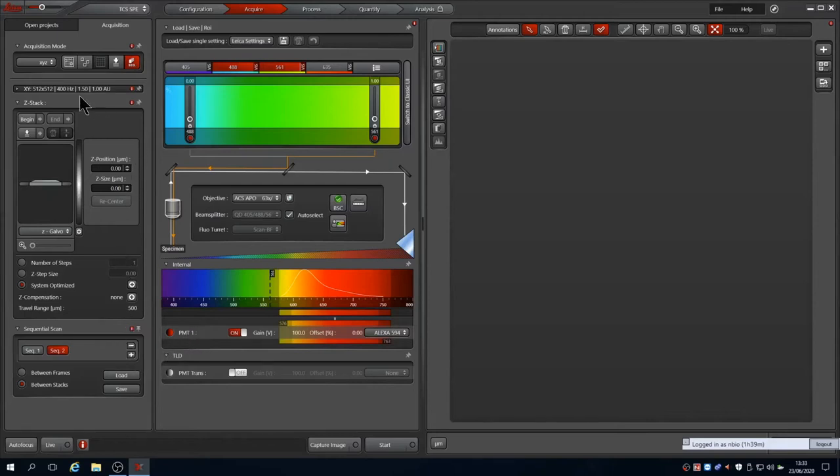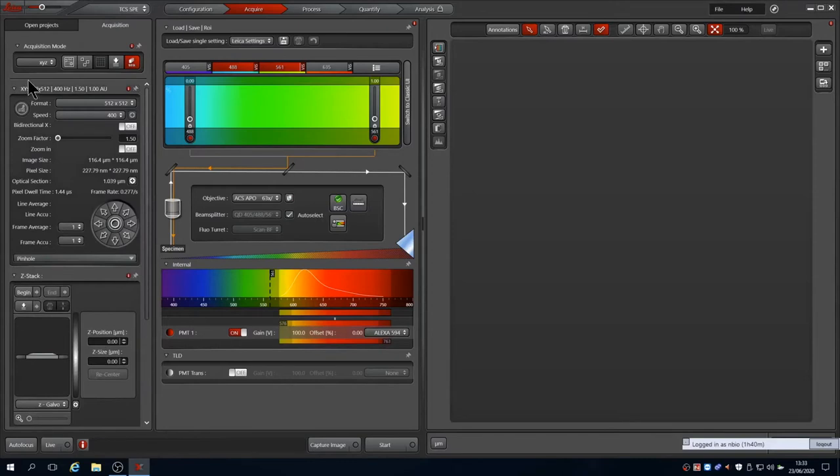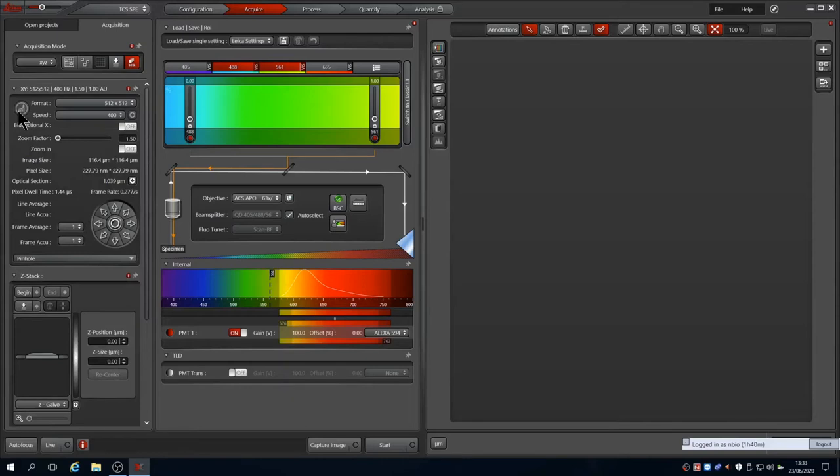Before we start capturing an image, we will review the global settings that are applied to the images. These are in the XY tab. It shows an overview at the top stating it is set to 512 by 512 pixels at a scan speed of 400 Hz and a zoom of 1.5 with an Airy unit of 1. These are adjustable in this tab and apply to all sequences or channels that we have in the image.